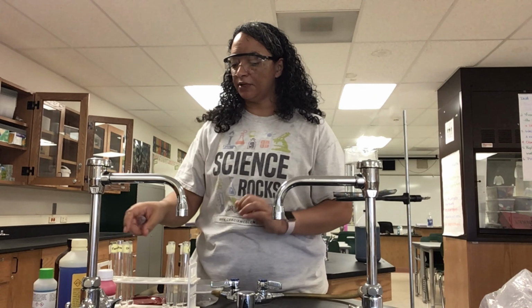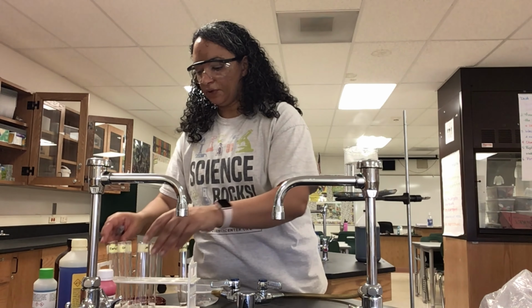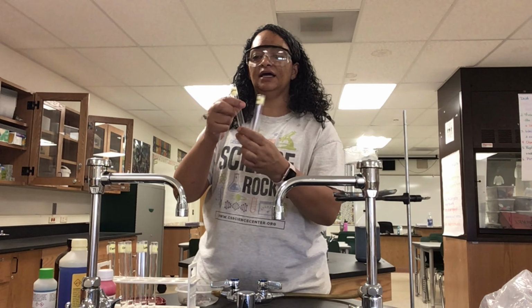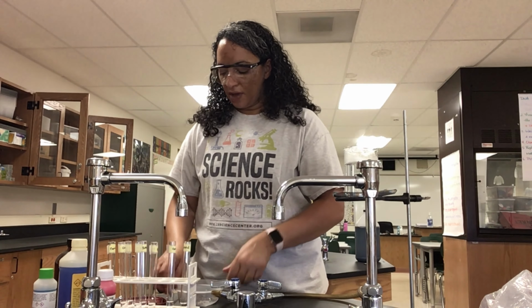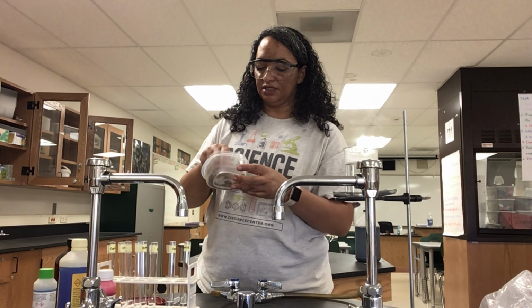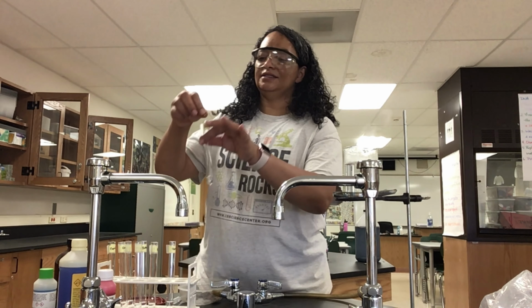All right, so first thing I'm going to do is I'm going to kind of move some of my test tubes over so I can focus on just the ones that I'm working with. So right here I have a seed and I have a control. All right, I'm going to put those down. I'm going to go ahead and take a pinch of this ground up acorn, which is like a paste, and I'm going to put it in my seed test tube.